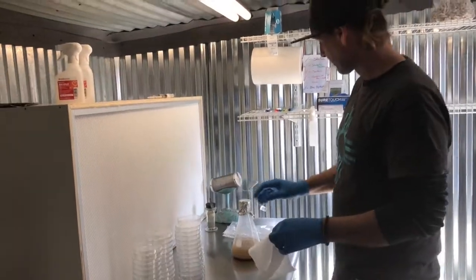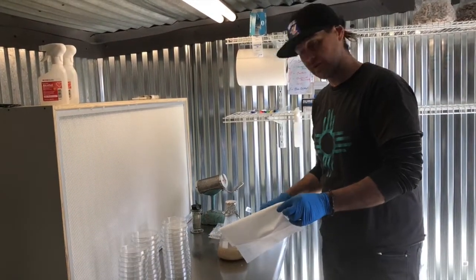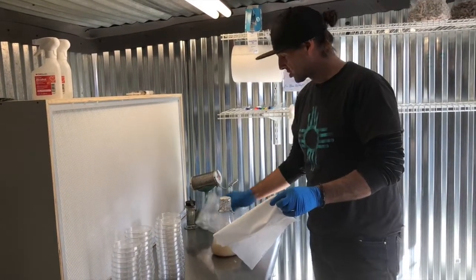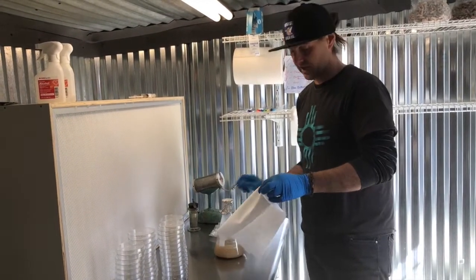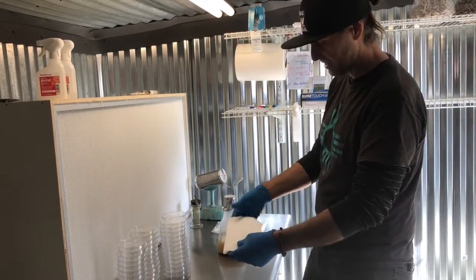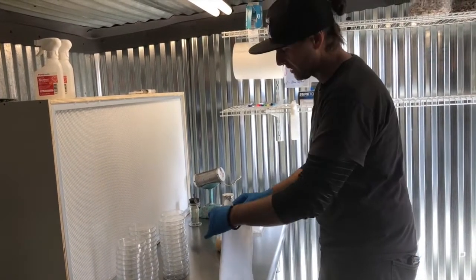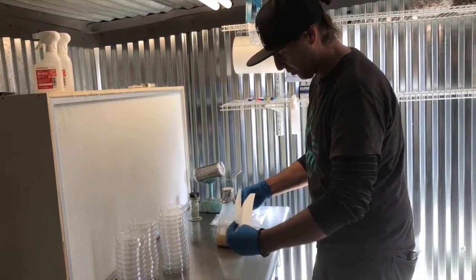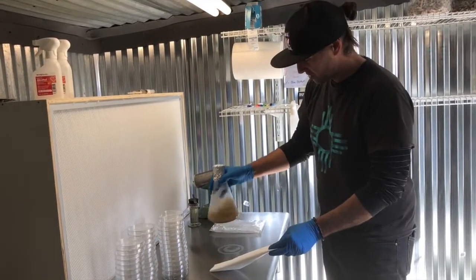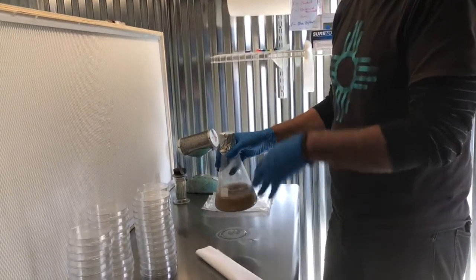A lot of times if you didn't mix enough agar you'll have plates left over, so what I do is leave one sleeve on the table until we're done. That way, if we have any excess plates we can't fill, we can slide them back into that sleeve and wait until the next pour. The agar has just recently quit boiling — it's still really hot.